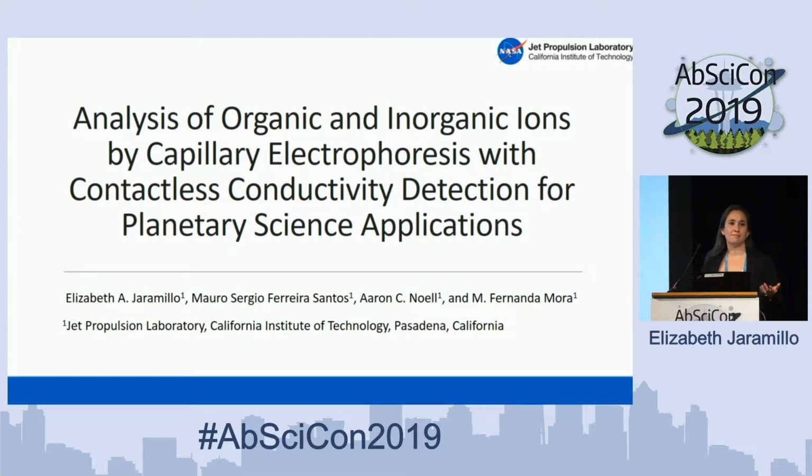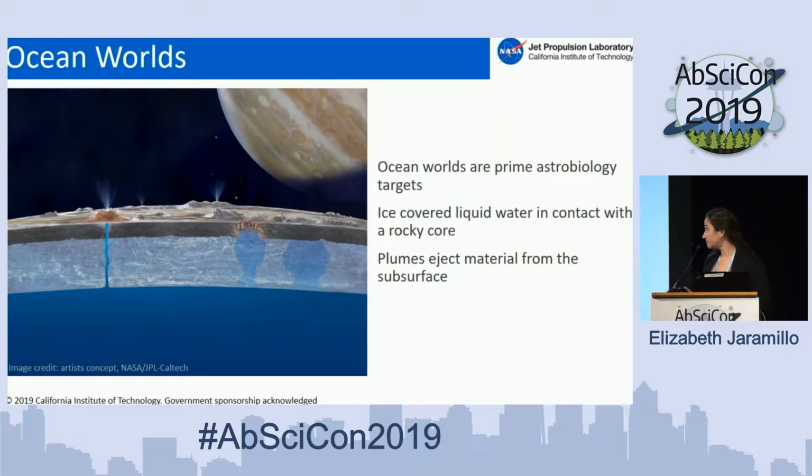And today I'm going to be talking about a method I've been developing for the analysis of organic and inorganic ions using capillary electrophoresis with capacitively coupled contactless conductivity detection, or CE-C4D for short. So the target for this method is really analysis of the samples from this ocean world.